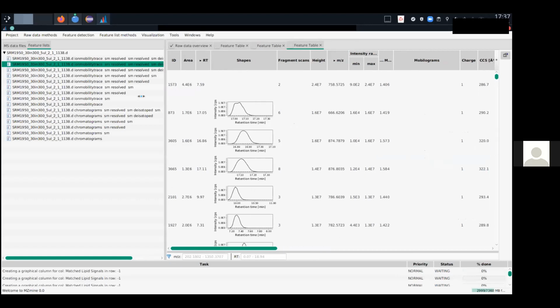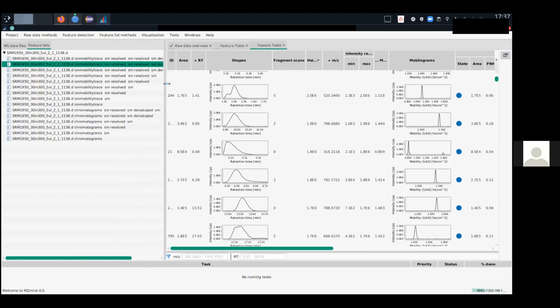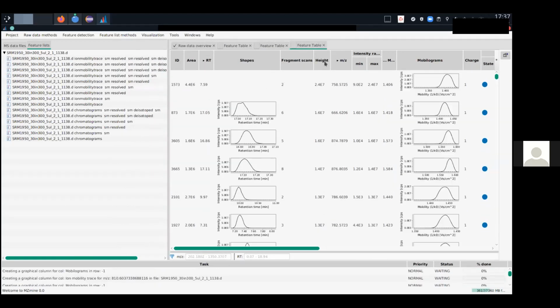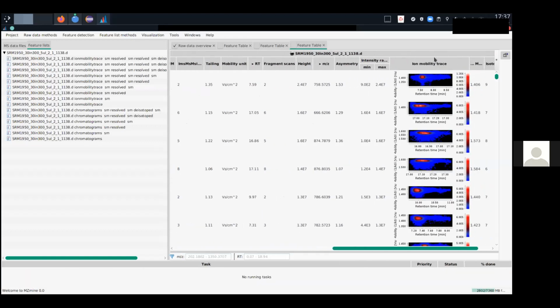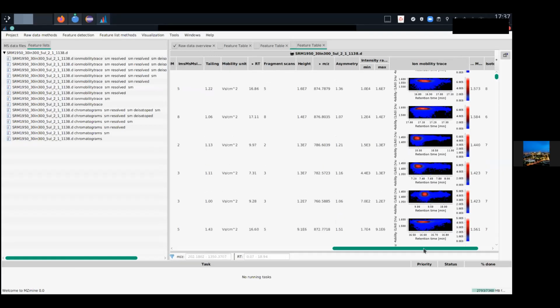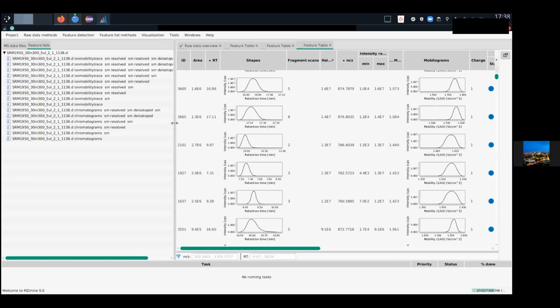just to make sure. We learned a lot this week about false positives, and this is just to remove those potentially false annotations. This one I didn't want to show yet. I just want to show you now that we have clean, more or less clean features in the ion mobility dimension. So you can see here. Okay, so this is basically the data processing approach.